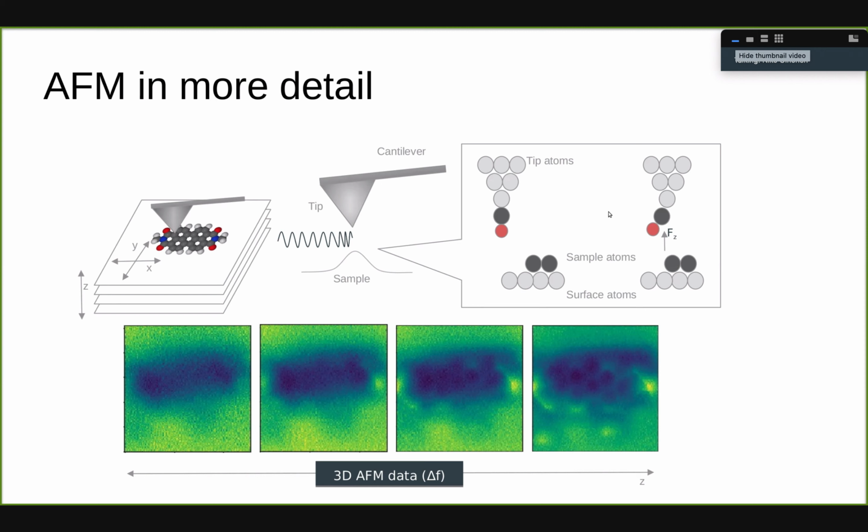Another important trick in very high resolution AFM imaging is the idea of attaching an additional particle, like a CO molecule, to the very end of the tip. The idea is that the CO molecule is flexible, so it will bend around the sample when you go close, so that you're not disturbing it too much.